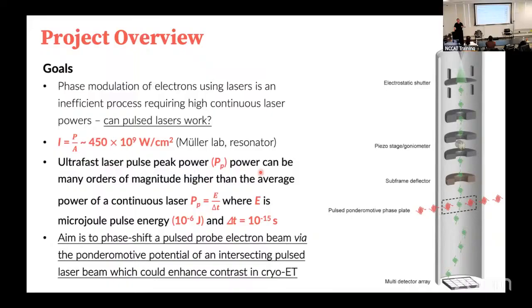Another way to do this is to use what's called a phase plate, like a physical phase plate. So this was first developed by Nigel Unwin, I think, in the late 80s, maybe 90s, something like that. And what Nigel knew was that in order to create the phase shift, he would have to have something in the back focal plane that would basically affect the electron beam but not block the beam. And so he knew that it would have to be incredibly fine in terms of a physical plate that goes into the back focal plane to change the behavior of the electron beam.